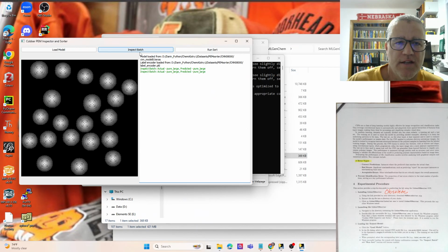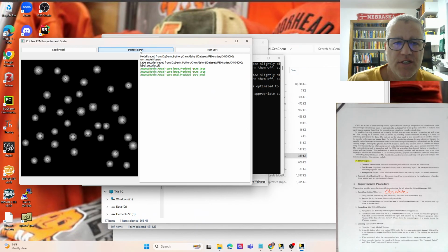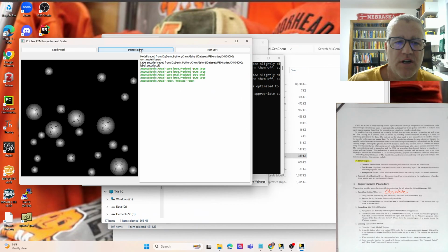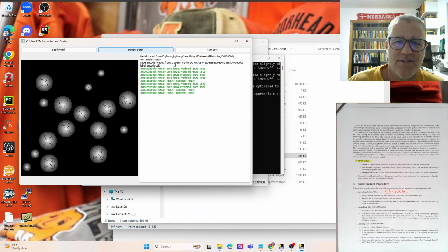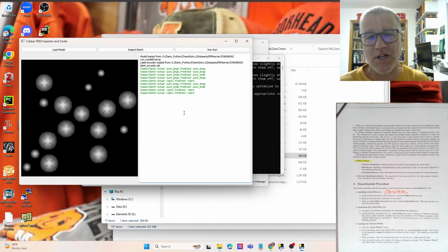Oops. Okay. Another large, pure large. Here's pure small, said pure small, so it's doing pretty well so far. Pure large. Here's reject, it says reject, right? So doing quite well. Let me try a few more. It's really doing well. Okay, well, we're well trained.